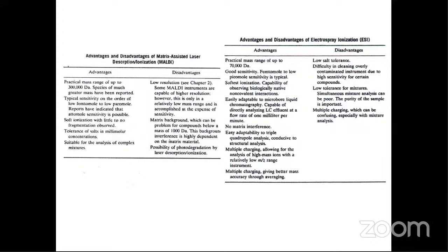If you have salts present in the sample mixture, then still MALDI can work. Where will you get salts? When I am recovering a protein, I may do something called salting out. Biochemistry students may know that. So we add salts to salt out proteins. So some salt may be present in your final solution. So MALDI TOF can really work for that. Okay. The disadvantages: the matrix background. Like I said, the matrix also will show a peak in your spectrum. So that should not interfere with your product.